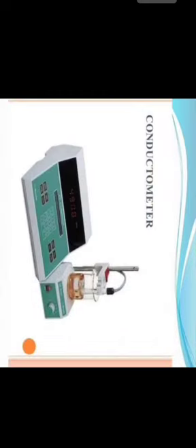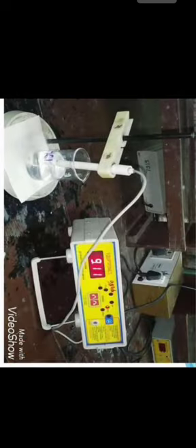So this is the conductometer, a device that measures the electrical conductivity of a substance and determines its ability to conduct an electric current. This is the manual setup shown.